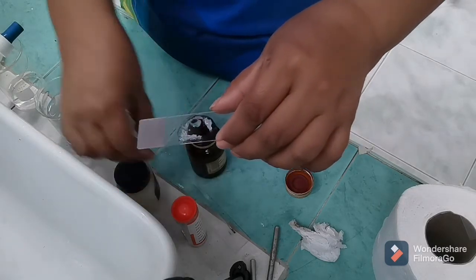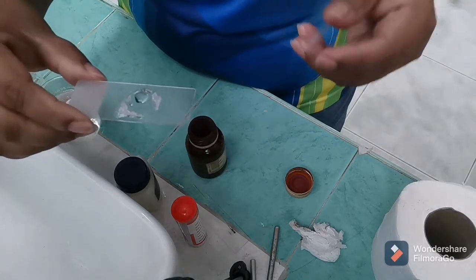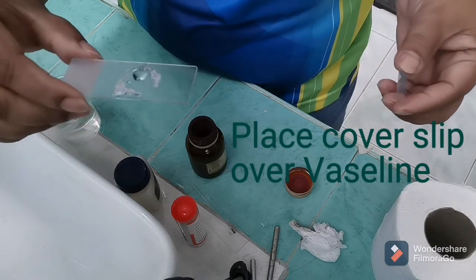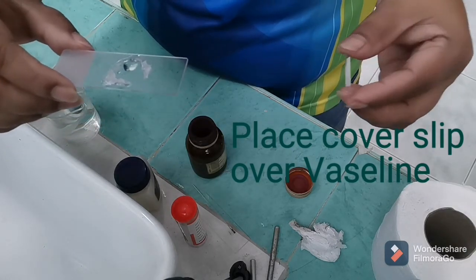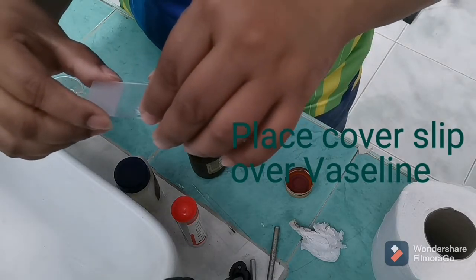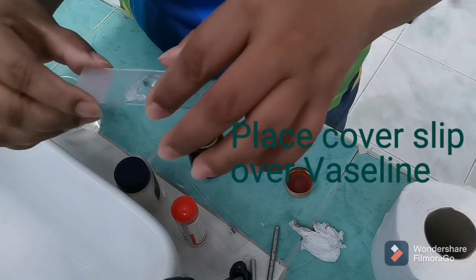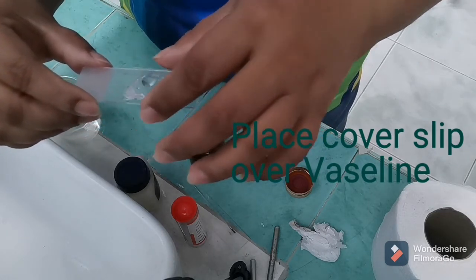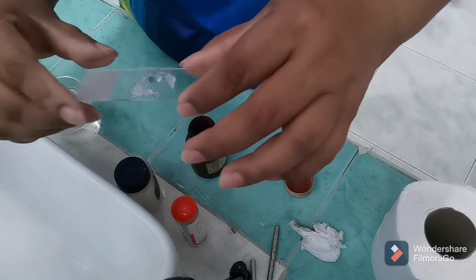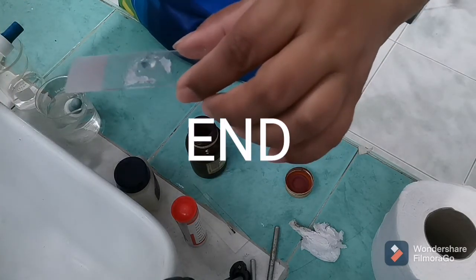So the next step is for me to cover this slide and then examine it directly under the microscope using both low and high objective. Just press it lightly or position it lightly to have a better focus later on under the microscope. So we are now ready to go into the microscope area.